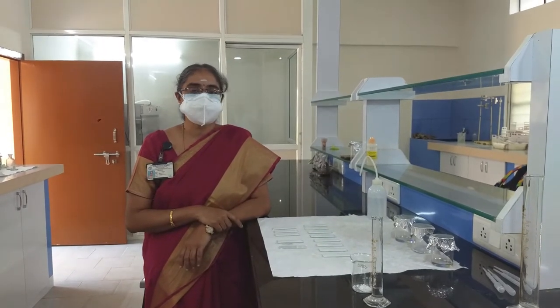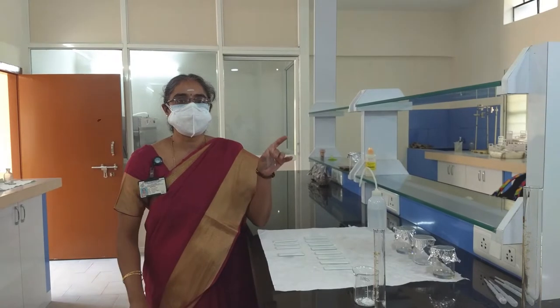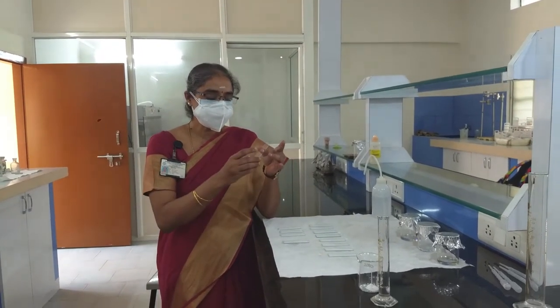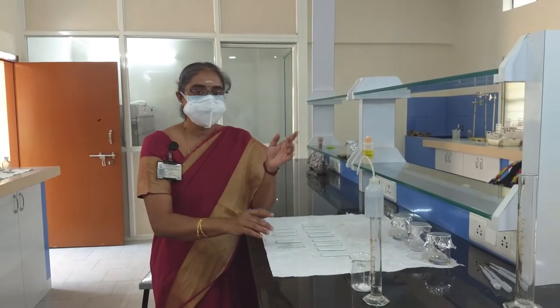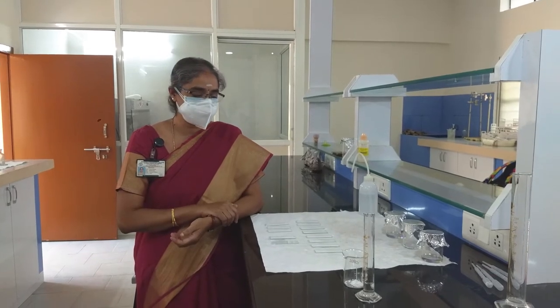The first section is preparation of the thin layer chromatography plates. For making the experiment simple, we have taken a normal microscopic glass slide that has been cleaned thoroughly on both sides. Make sure there are no water droplets or dust on the plates. You can arrange as many plates as you require.